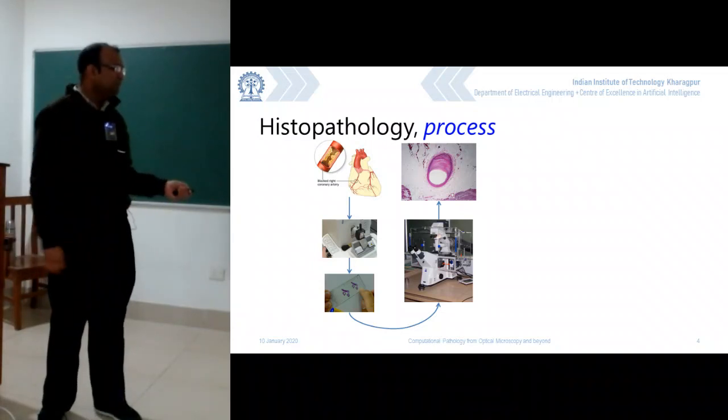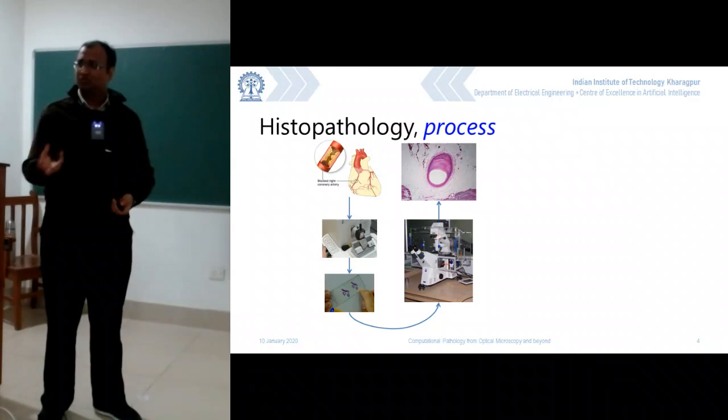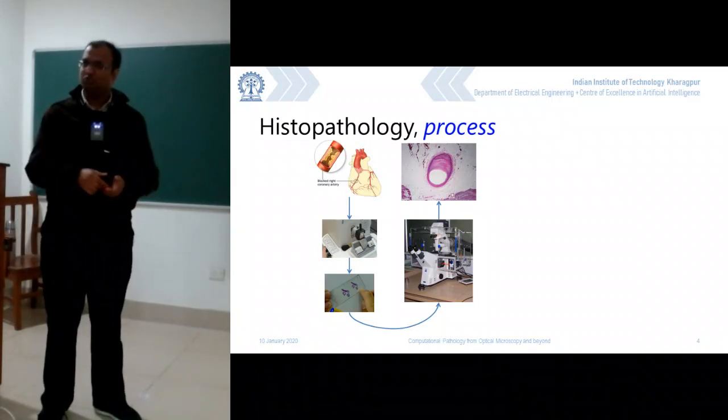So here we are much better off. We have a costly microscope which costs about a crore. I think today it costs about 2 crores. The fluorescence microscope which you saw is that one. So it costs a very nominal price, only 2 crores, nothing major. The one which was kept outside is a bright field microscope, does not have fluorescence, and that also does not cost a lot, something on the order of 5 lakhs. A typical lab would have a much cheaper version of a microscope, I would say about 30,000 to 40,000 rupees.